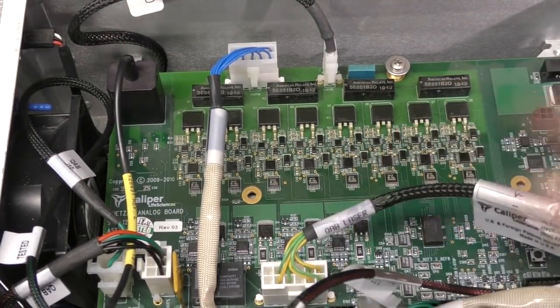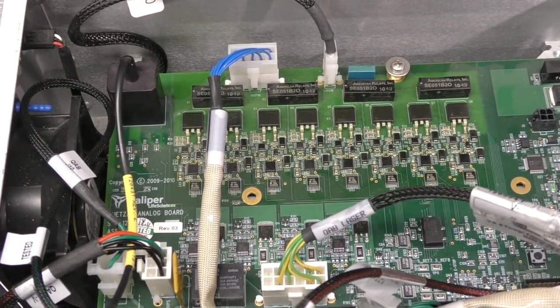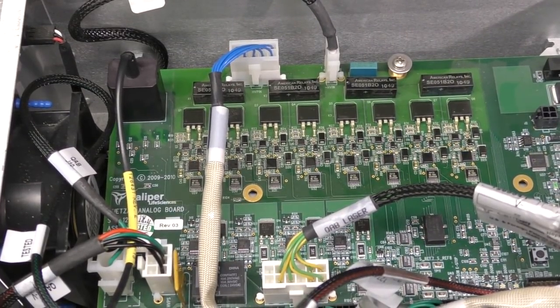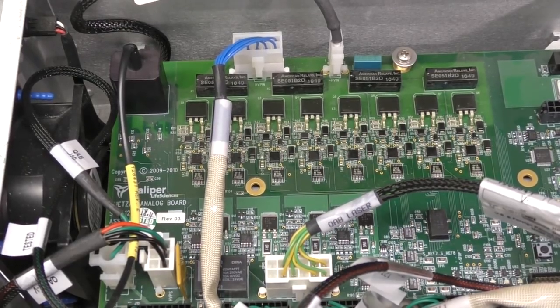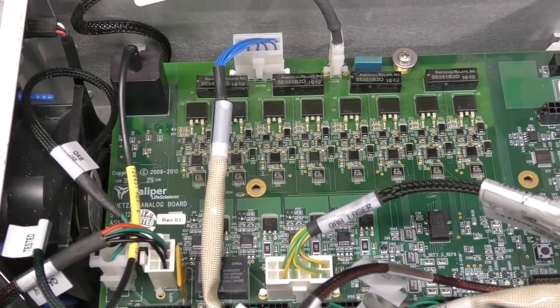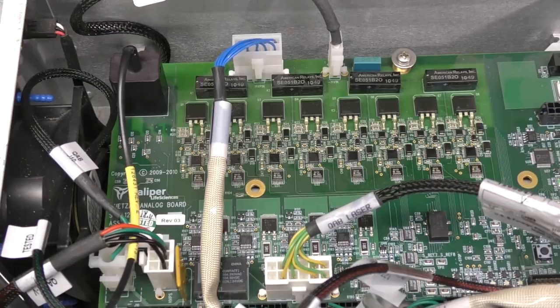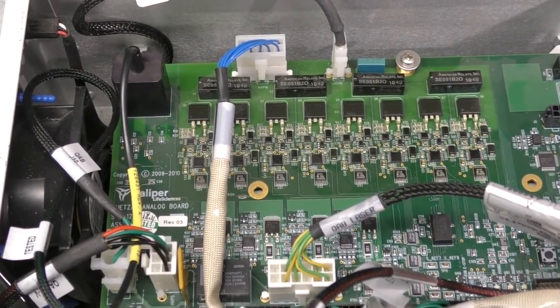Take a look at that. Might be quite interesting to see how they deal with the high voltage. Electrophoresis generally works in the sort of few hundred volts range, and in fact if you want a high voltage power supply cheap, it's worth looking at electrophoresis power supplies, because they're generally available quite cheap as surplus. You typically get anything up to 1000 volts at tens to hundreds of milliamps, so they can be quite nice high voltage power supplies, and obviously quite dangerous, which is always fun.